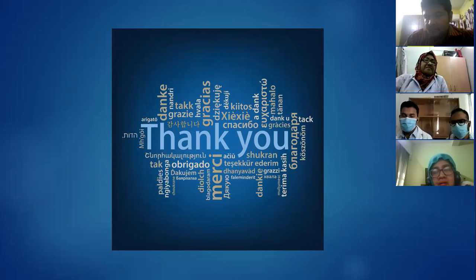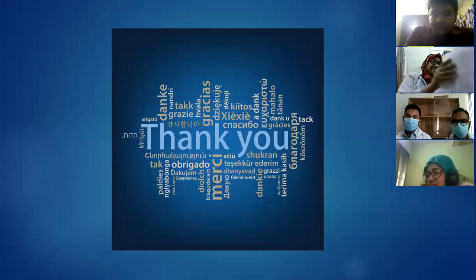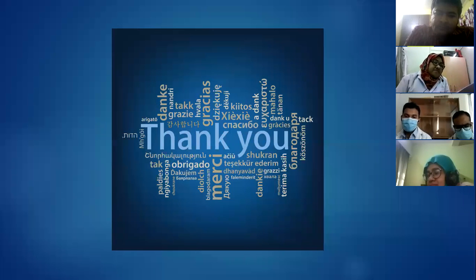And then all the AFB smear positive slides are graded based on the IUATLD scale. What is this scale? What is the importance of this scale? IUATLD. In your journal, they mention this scale.